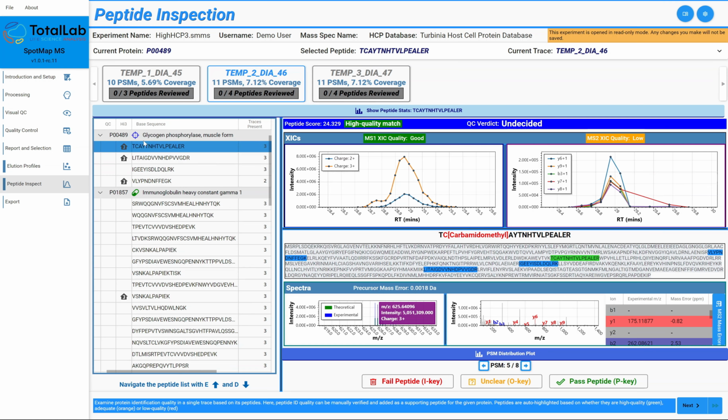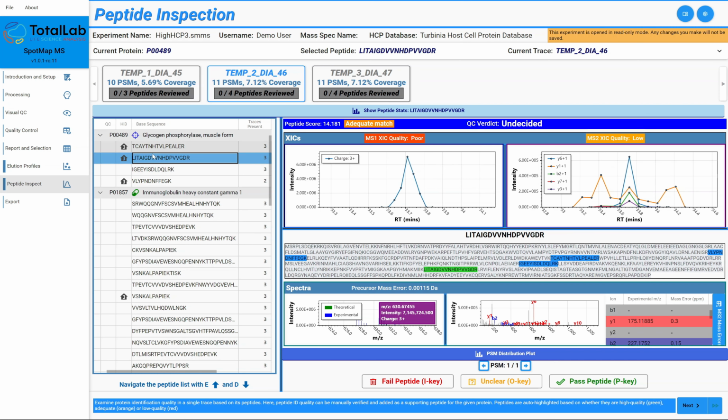And you can tell when you're running through the peptide inspection section of the workflow if we've got this 3 inside the house icon next to the peptide match. It will show you that we've actually used this in the Hi3 quantification of this protein. So we've used the top 3 PSMs based on peak area, and we've used them for this peptide and matched it to this protein. The result is the relative quantification that we've got of this protein. It's difficult, but we've used 3 PSMs to match this, and then all of these have been used to match this. So they're groups within each other.